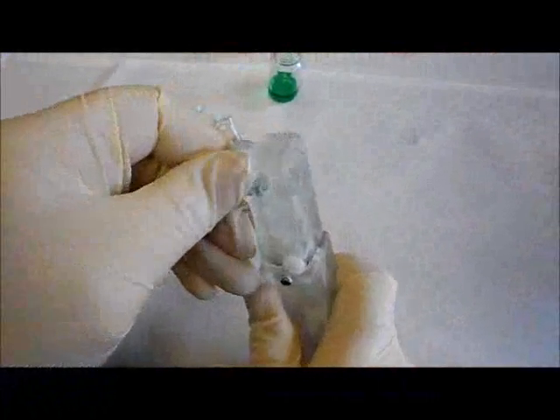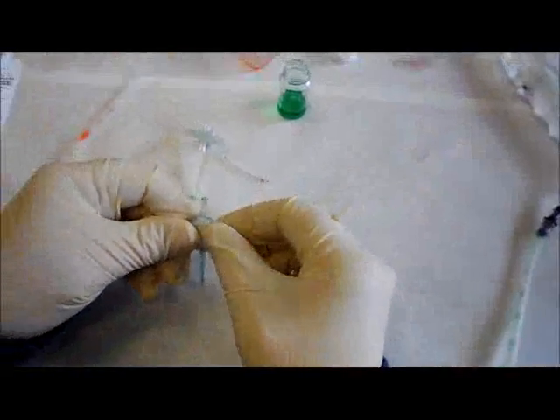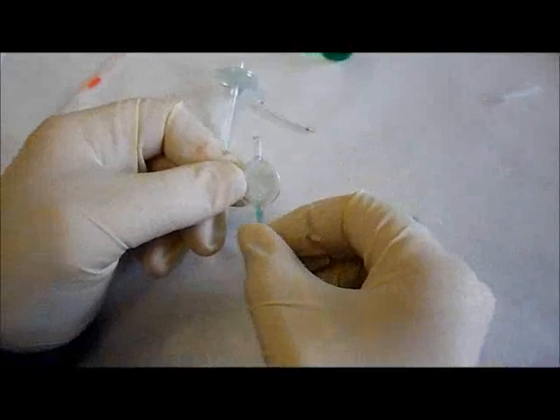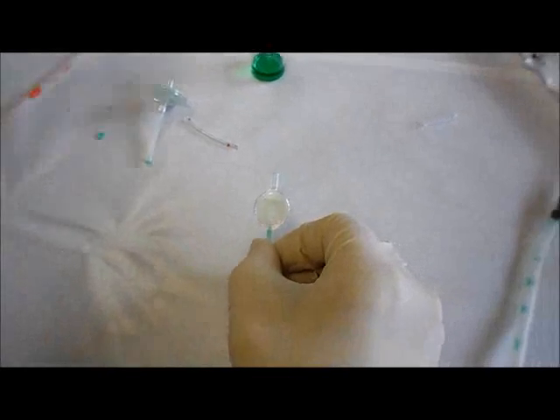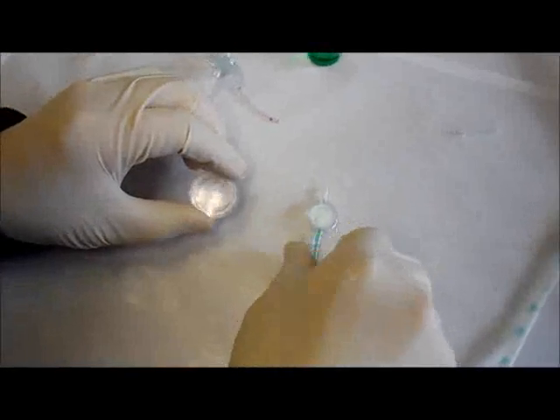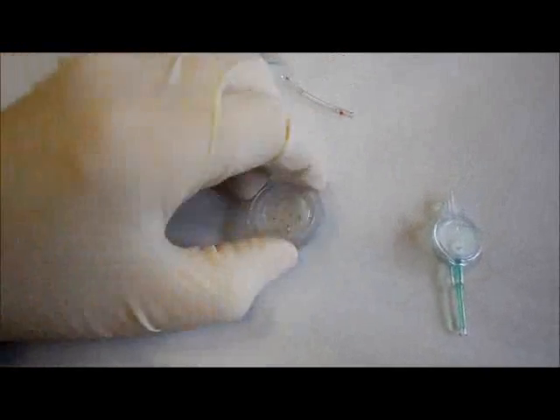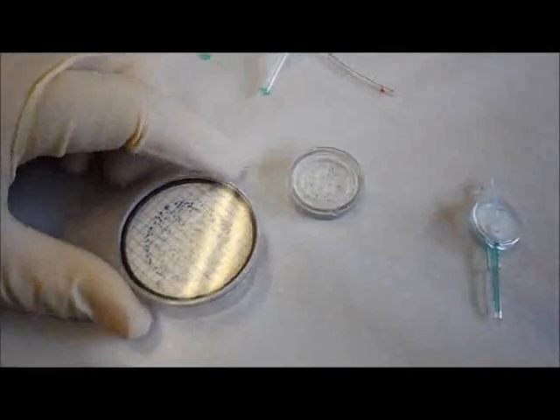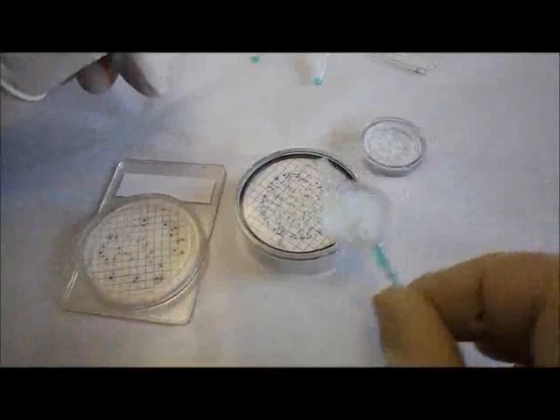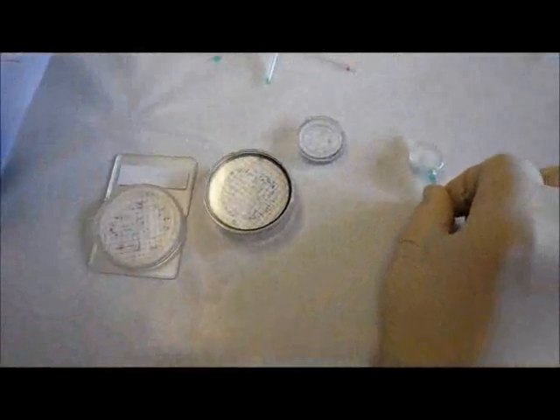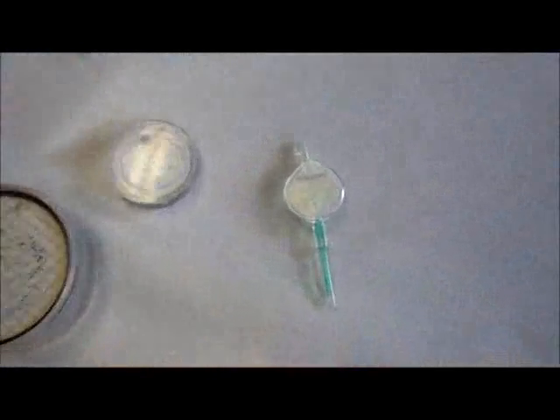So that is how the cartridge is designed to work. I mentioned that it is scalable for various applications in a research laboratory or an industrial application or for field work. This technology is implemented into a larger cartridge shown here of 25 millimeter of our design, and it can be incorporated into this, a classic microbial filter of 47 millimeters, and also as well into device such as this which would be also working on the same design as the little cartridge I was showing. So that is the demonstration of filterability.